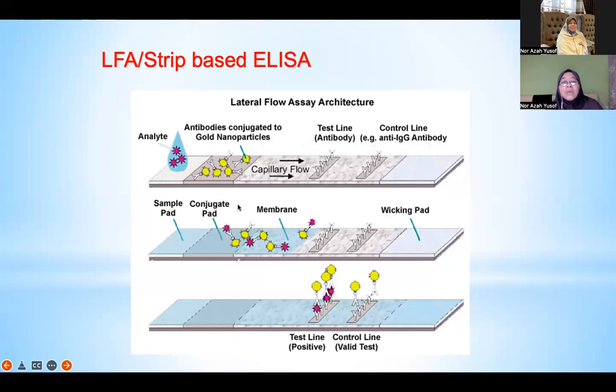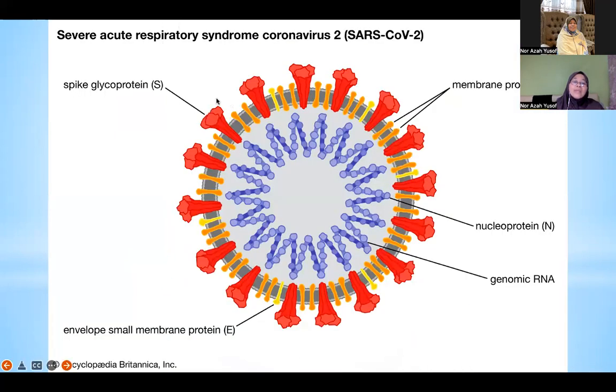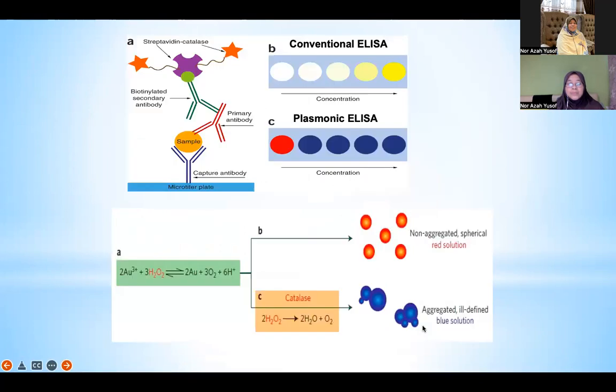Now if it is positive, you can see that the Y-shaped antibody is capturing the analyte, which is the virus, specifically attaching itself to the S protein, if the test is based on an S protein specific antibody. If it is based on an N protein antibody, it is a bit difficult because it is inside. So most of the time we use the S protein.